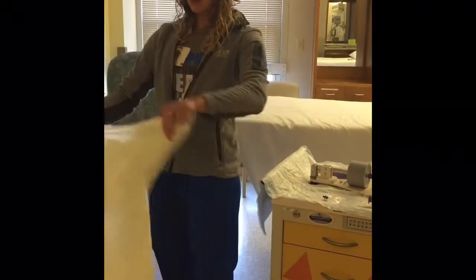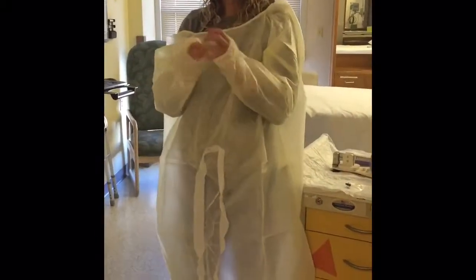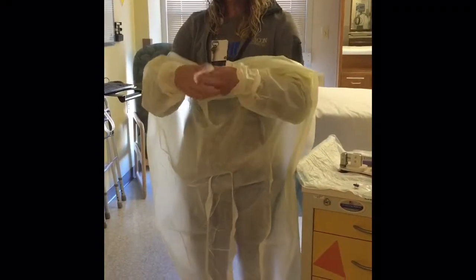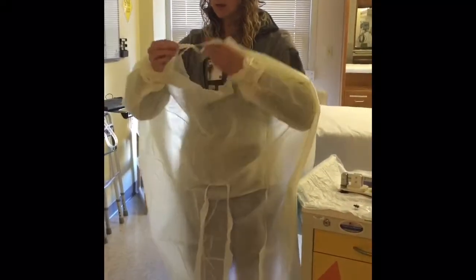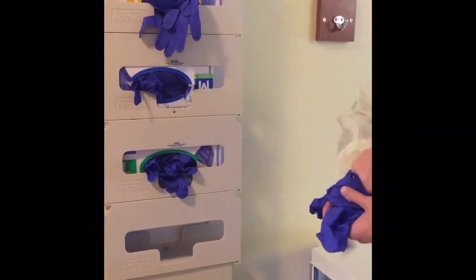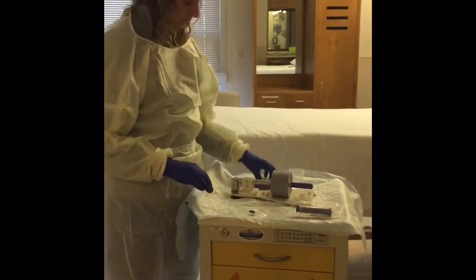So I'm going to put my isolation gown on before I start crushing or even touching the pill. And then I'm going to use 2 pairs of our regular exam gloves while I'm crushing. I just want to reiterate, these precautions are to help protect yourself from any exposure to a hazardous medication. Okay, so I have my PPE on, and now I'm ready to get started with crushing.